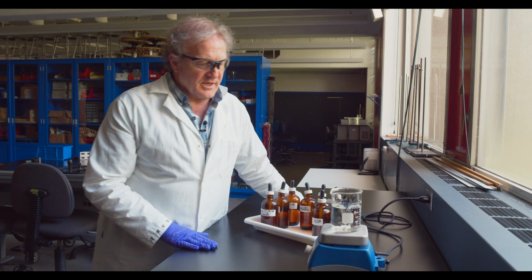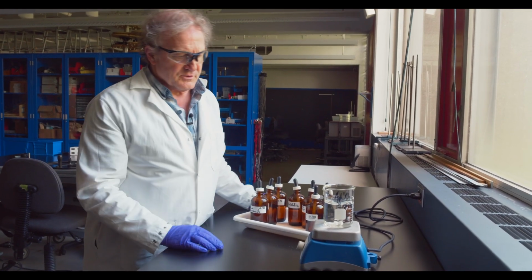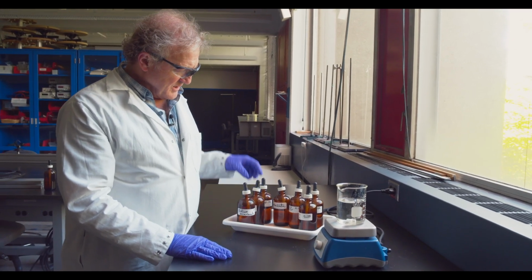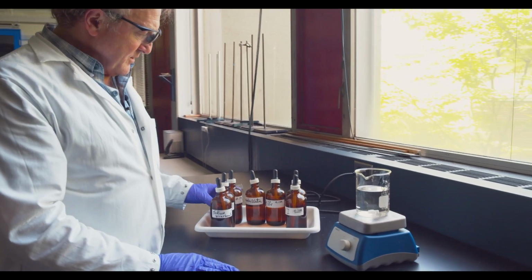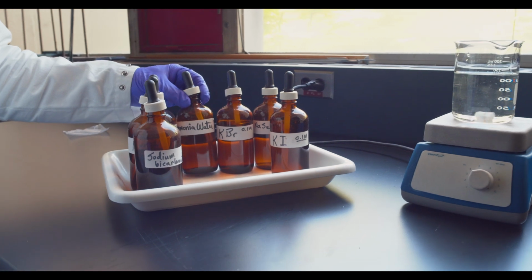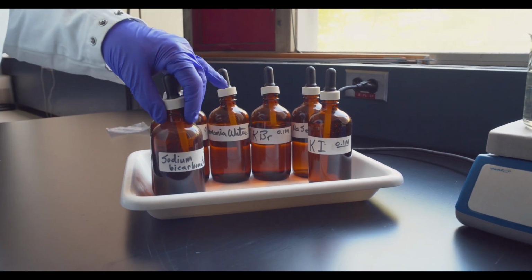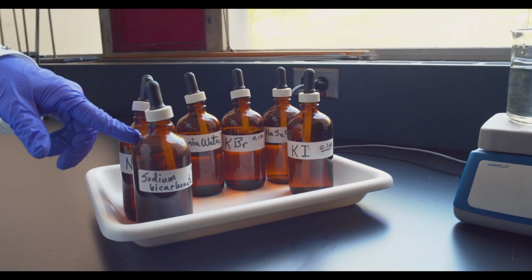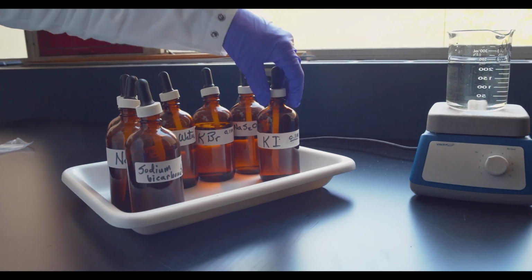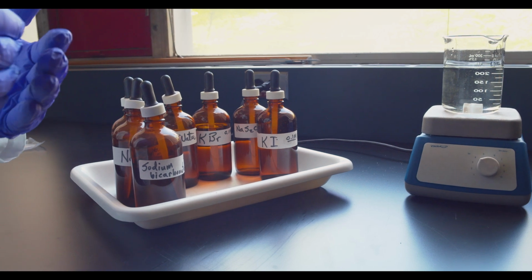We're going to do the silver solubility series as far as we go. We're going to take a very dilute solution of silver nitrate, and we're going to add to it these 7 solutions in series. And the solutions are going to form precipitates and complexes. As we go down the line, each of these will bind more and more strongly to the silver ion until we get to the potassium iodide, which binds the most strongly to the silver, forming silver iodide.